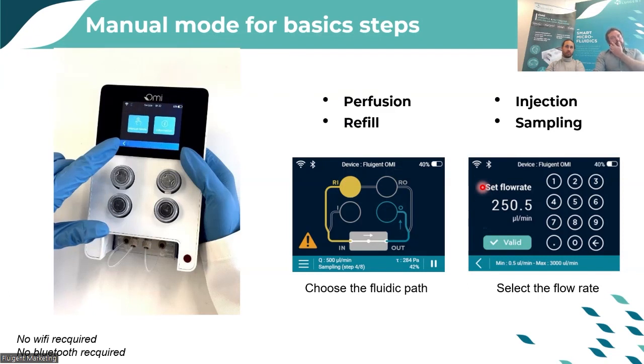You can also, if you want, select recirculation and it will recirculate. So this is really easy when you want to do some quick test or quick first operation before launching a real protocol. So yes, it's for convenience that this mode exists.